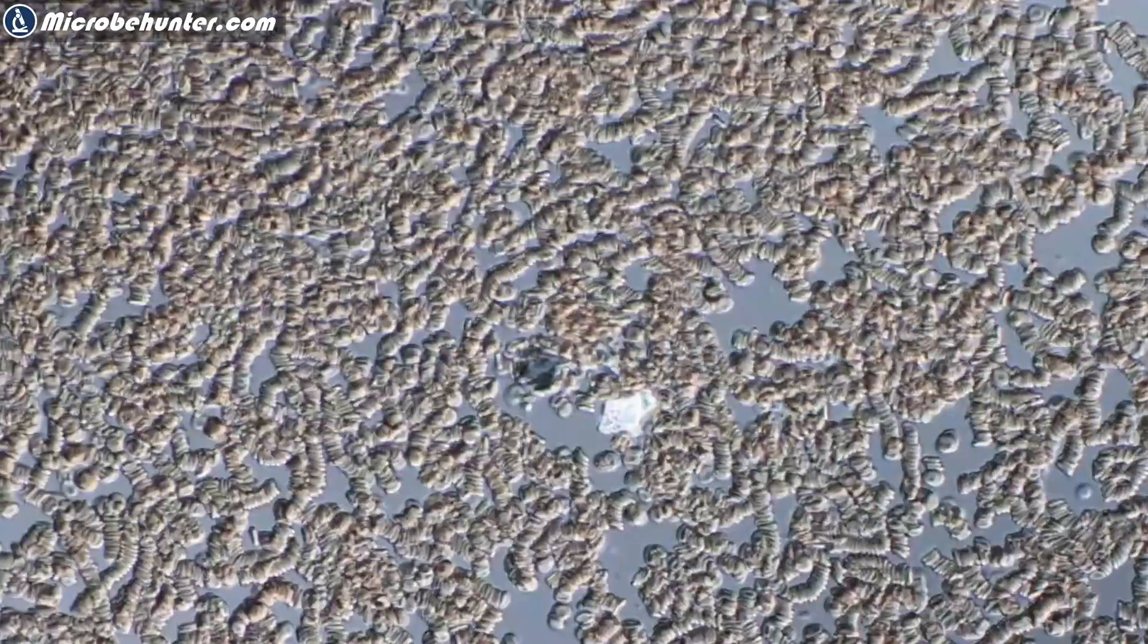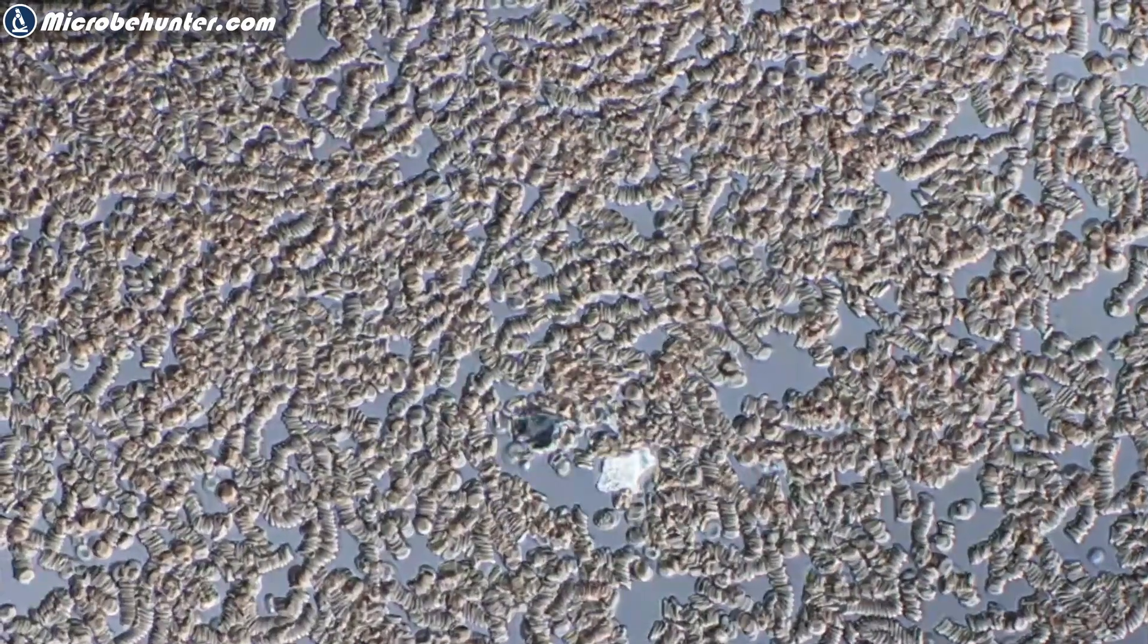Or for example, uric acid crystals. Sometimes you see crystal shaped structures on your sample and these are uric acid crystals. You've got another problem. But in reality these are simply leftover glass pieces from the manufacturing process of the glass slide. It simply hasn't been cleaned properly. But this has absolutely no medical meaning at all. So why are they interpreting uric acid crystals or cholesterol plaques? I mean, studies show you're not even able to see cholesterol plaques and uric acid crystals under the microscope.